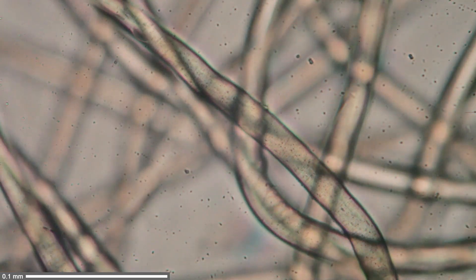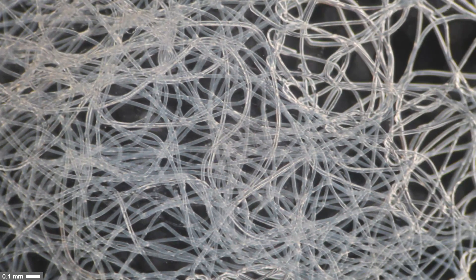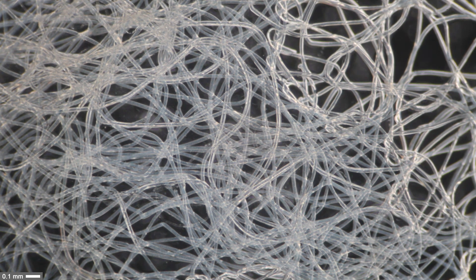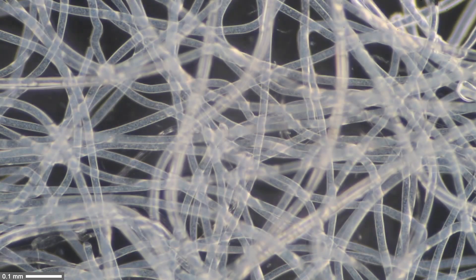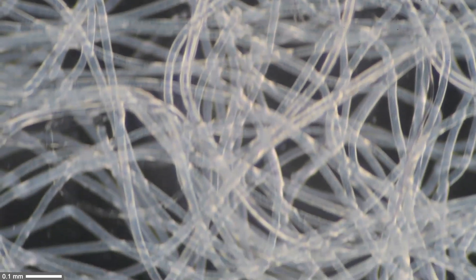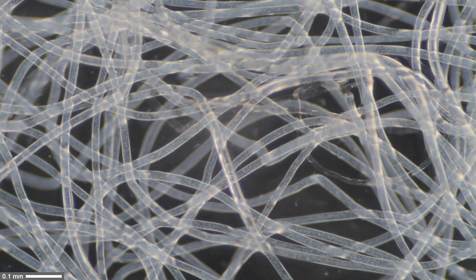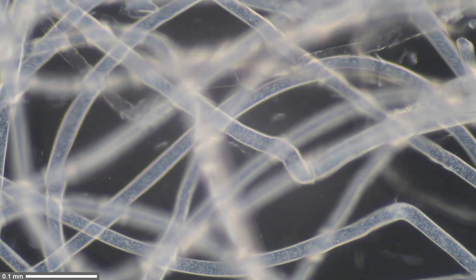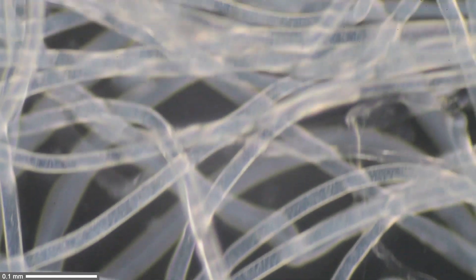I've right now been playing around a little bit with the diaphragm, with the condenser diaphragm, and now we're in dark field. You can basically back with the 4x magnifying objective, and in this case, the fibers reflect the light, and there is no direct light from the lamp. I'm again going up with the magnification. And this already allows us to see some of the structural details inside the fibers. You can actually see that they're a little bit transparent, and there's some structural details. Now, the thing with nail polish is that it is hydrophobic, and this means that the sample has to be completely dry if you want to mount your specimen. It doesn't mix well with water, so that's one of the problems.